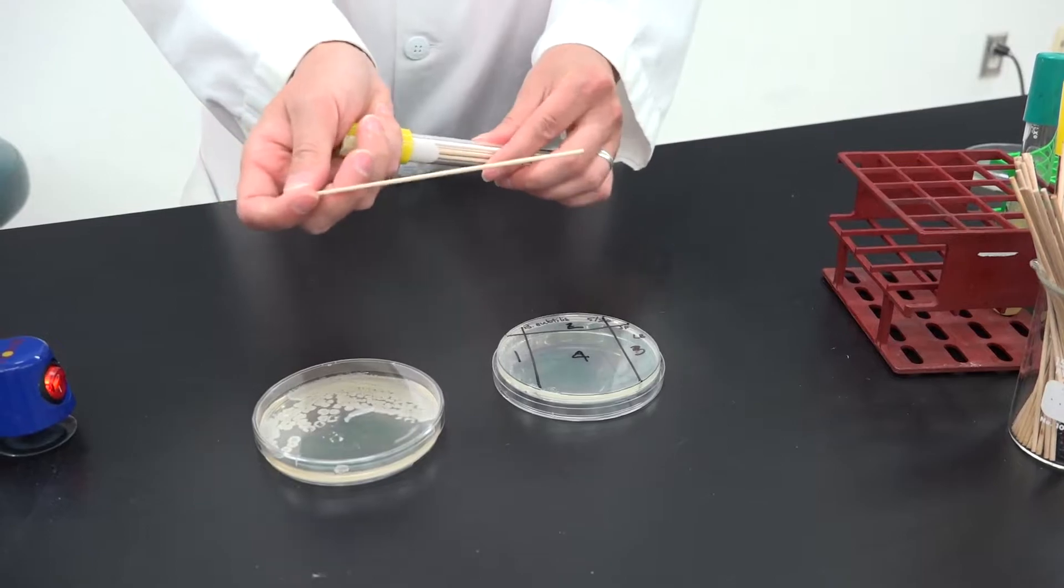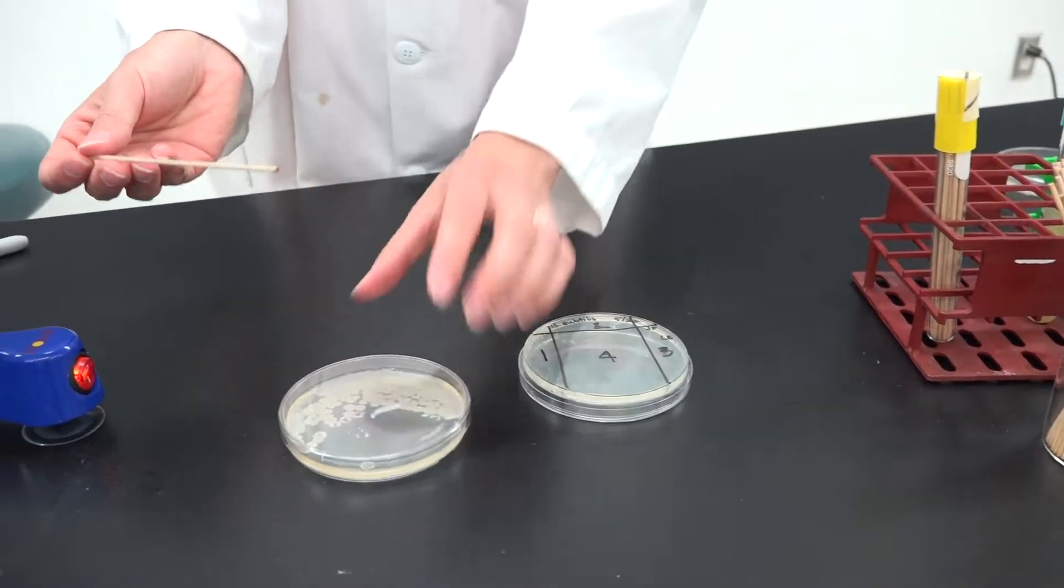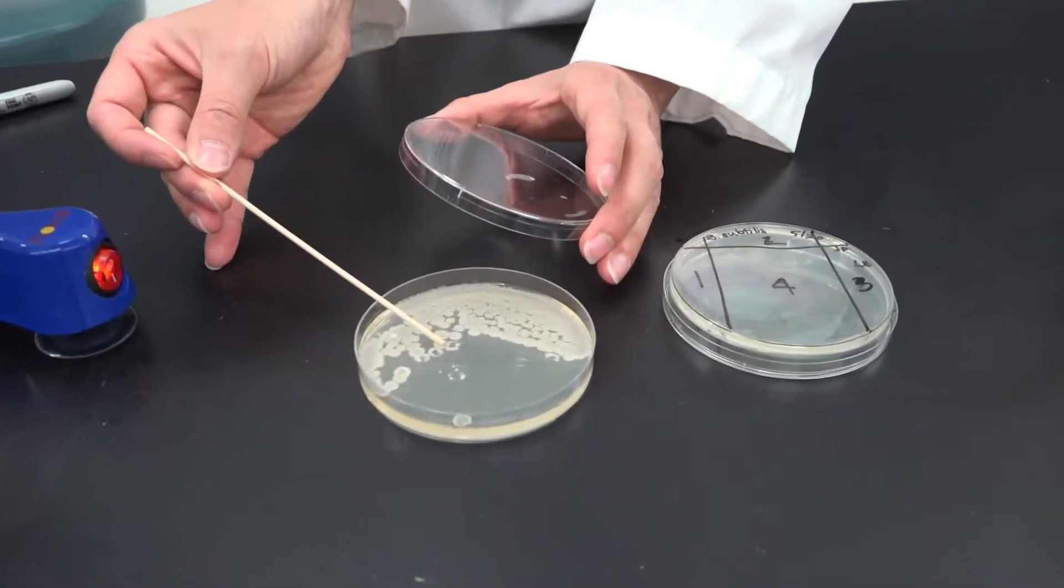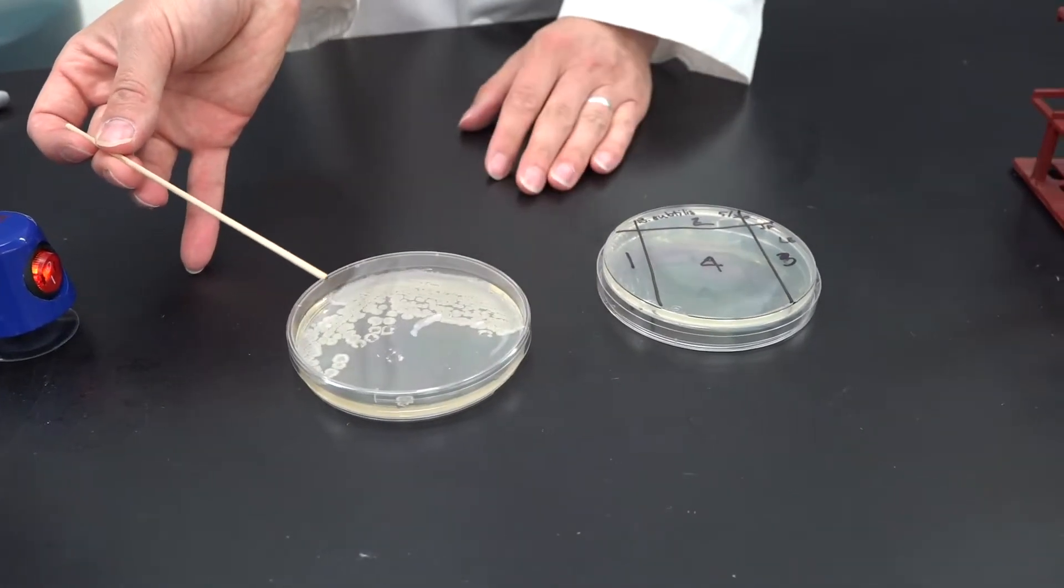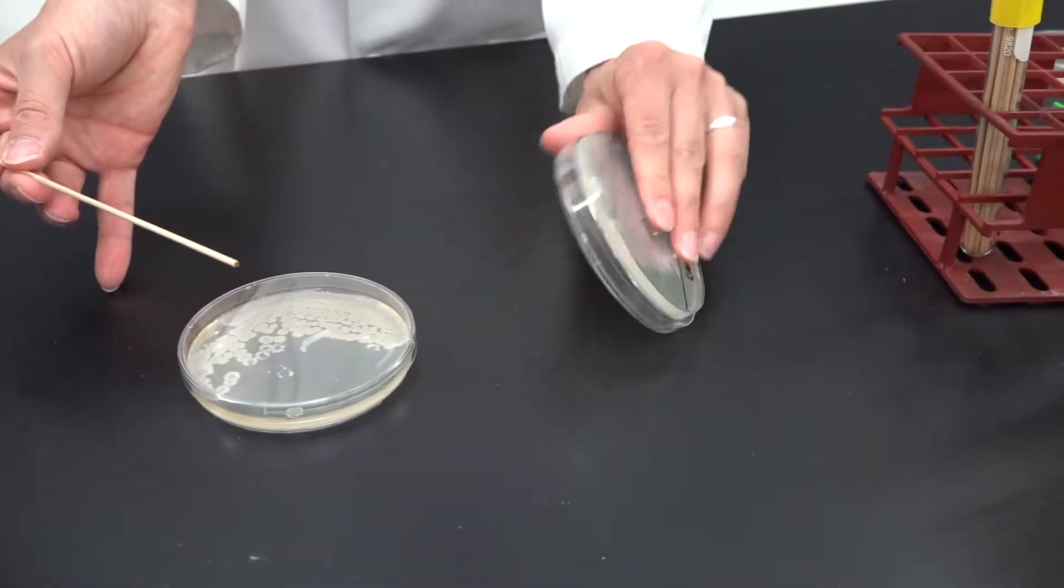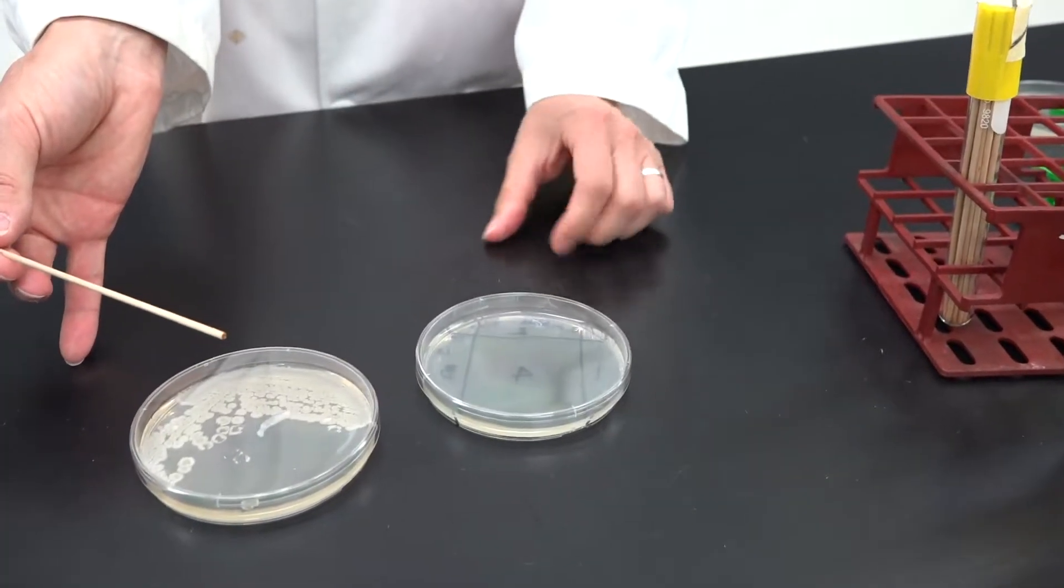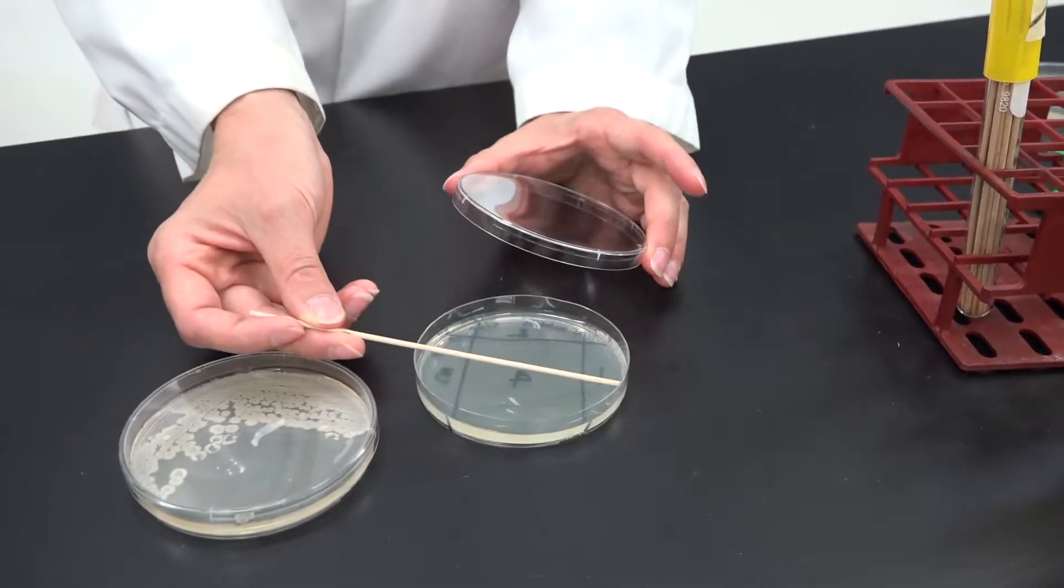Remove a sterile stick from the tube and touch a single colony on the source plate. Turn over the plate that you're going to streak and in quadrant one, spread the bacteria evenly across the entire quadrant.